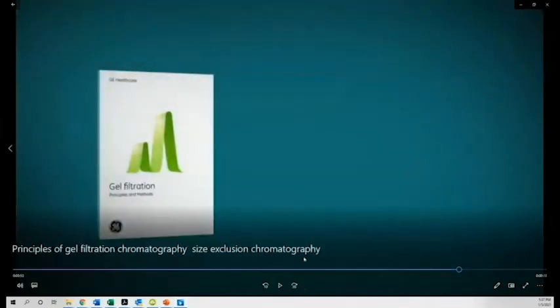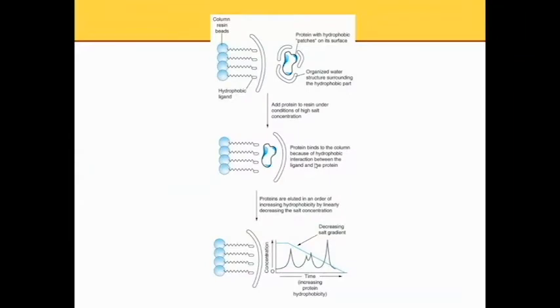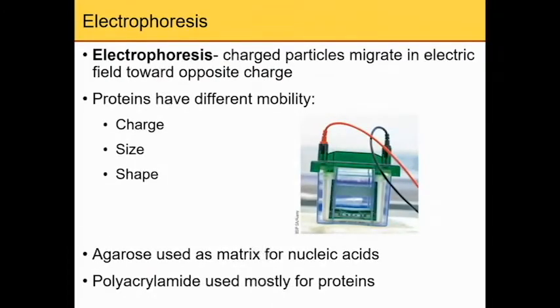So that's the gel filtration, which is a size exclusion chromatography. Okay. And this section is about electrophoresis. With electrophoresis, basically, we try to separate the protein mixture, and then we can evaluate the protein quantity, quality, and also the protein size, right?